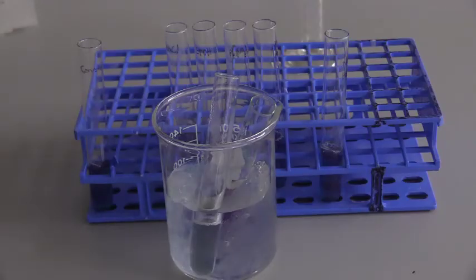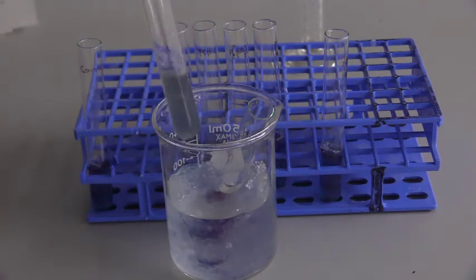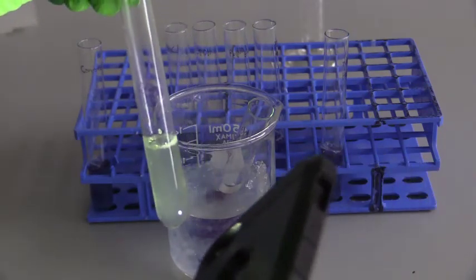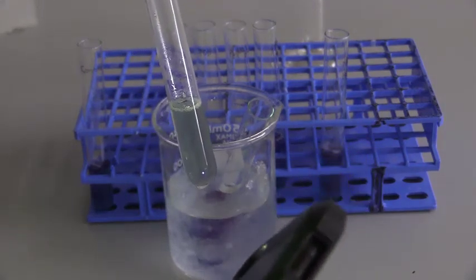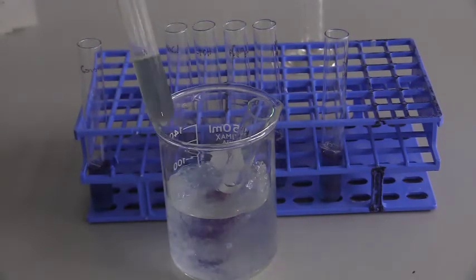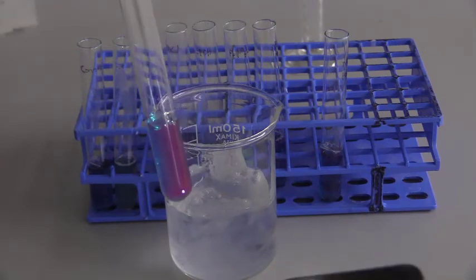So it's been a few minutes. We can check to see if cooling down the hot sample will allow it to return its activity. So is the protein going to refold itself after it's been cooled down? Is that still fluorescing red the way it was before? And how about that cold sample?